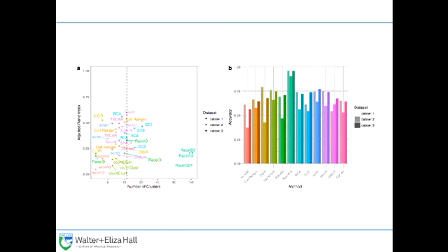Here there are something like 12 true clusters, actual biological cell types, and RaceID2 splits those into heaps and heaps of clusters, up around 150 or so.